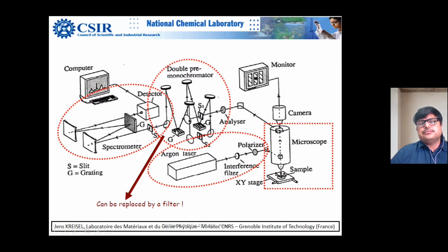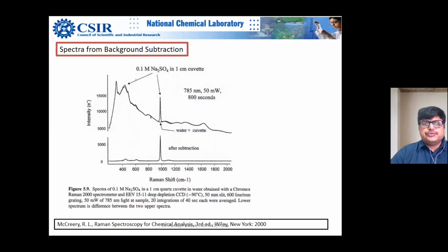And then even the resolution of the spectrophotometer becomes better. So instead of 1 centimeter inverse, which will be the case for a subtractive triple monochromator, in an additive spectrophotometer you can get resolution down to 0.1 centimeter inverse. This is really amazing. So I will show some examples.